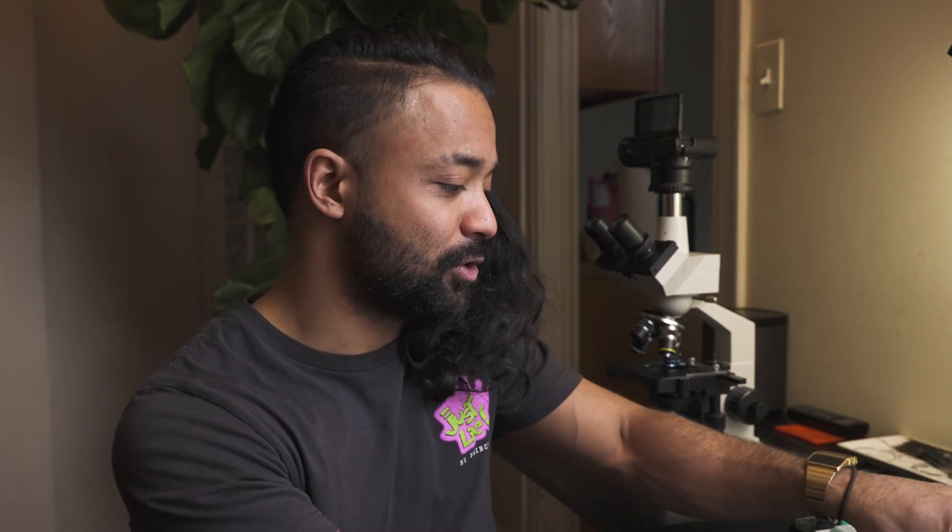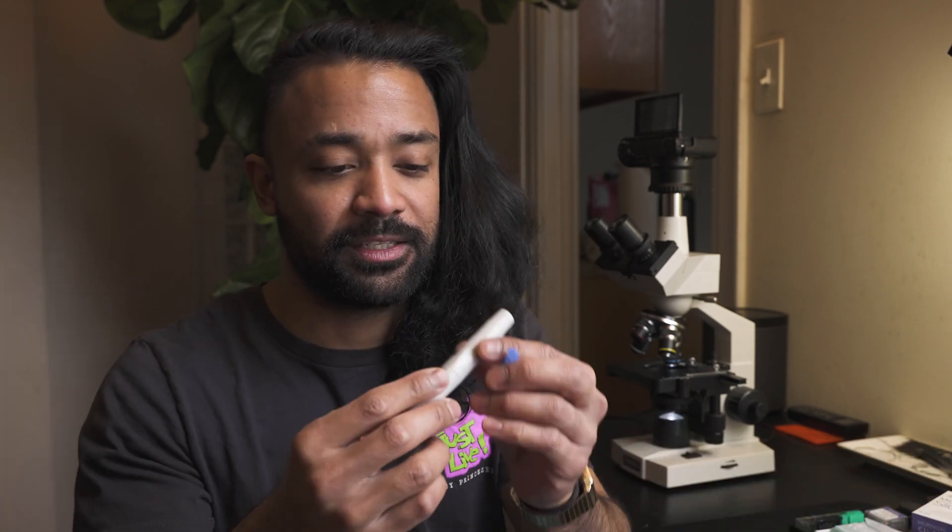Alright guys, check it out. Today I'm gonna be checking out my own blood under my microscope because I'm super curious - I always wanted to know what blood looks like, and I think it's fun. So now let's go extract the blood.